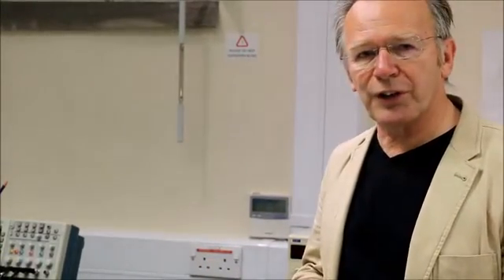So our goal is to use this microscope, which is a high-speed version, to image the surface of cells.